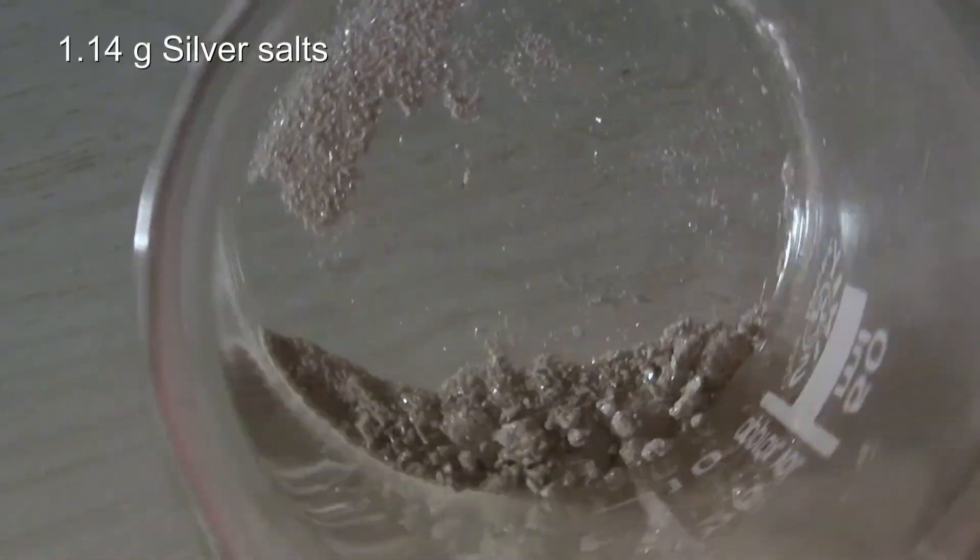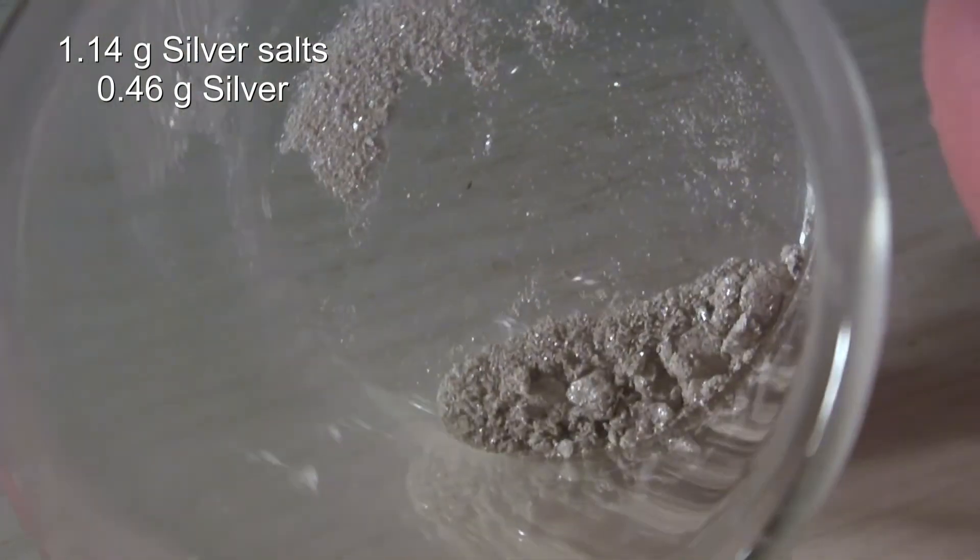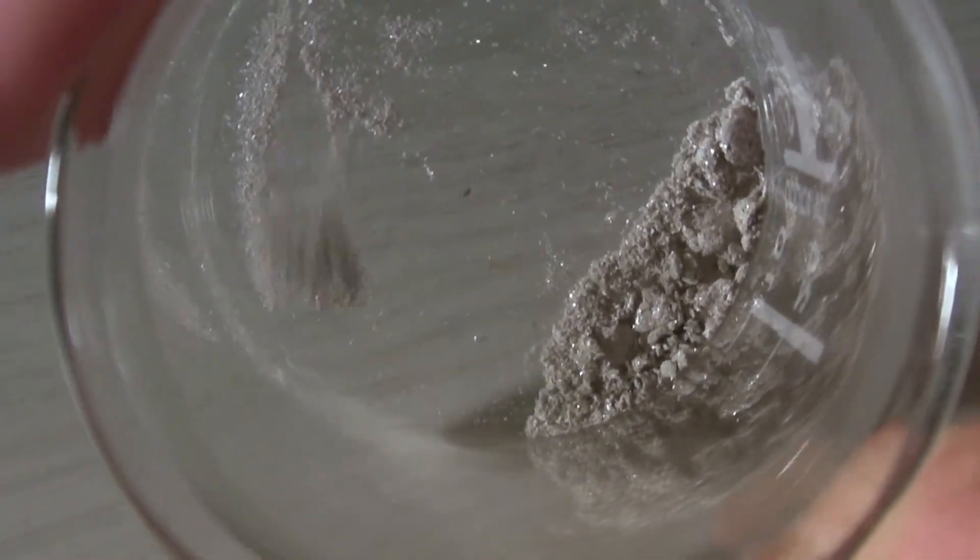From 1.14 grams of silver salts, 0.46 grams of silver were obtained, which seems to be a quantitative yield when the loss due to the iodide is considered. What's interesting is that under the microscope it can be seen that the particles have a branch-like structure.